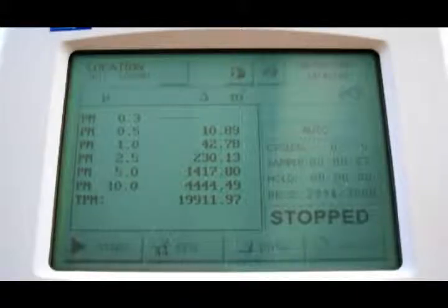The motor will kick on and it will take a few seconds until you see counts displayed on the screen. On the right of the screen, you will see a countdown for every sample taken. If you set it for 1 minute, for example, you will see a countdown of 60 seconds. Below this number, it will show you how many measurements it has recorded out of 3,000.